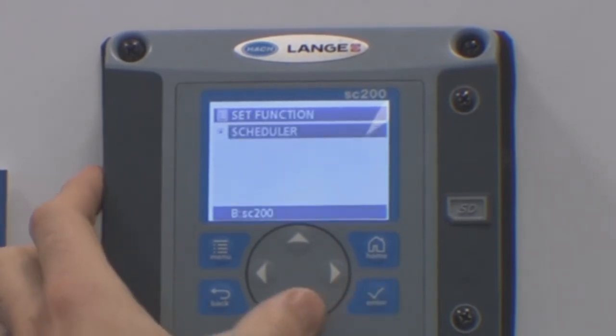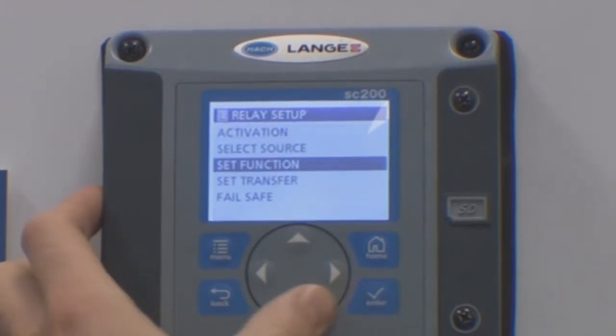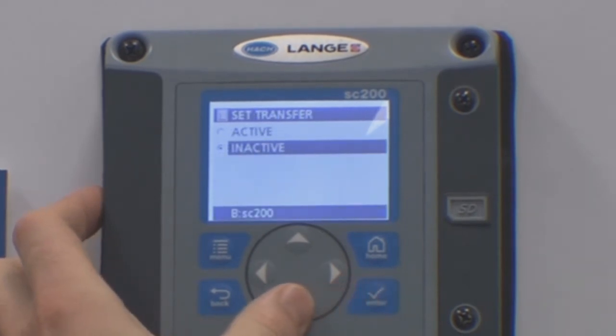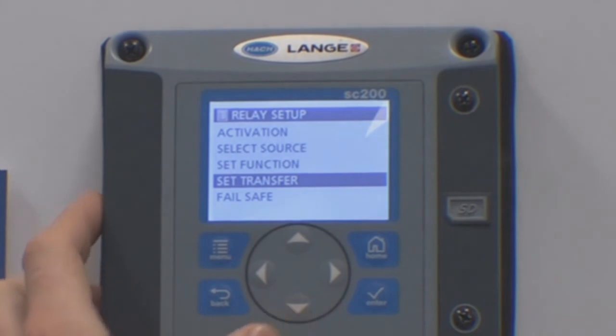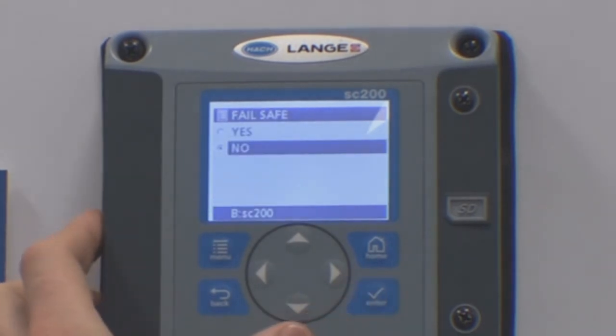Under set function, check it is set to scheduler — this is the real time clock. The transfer will need to be active or inactive, depending on whether you have connected to the normally open or the normally closed side of the relay. This will also need to be checked along with the fail safe.